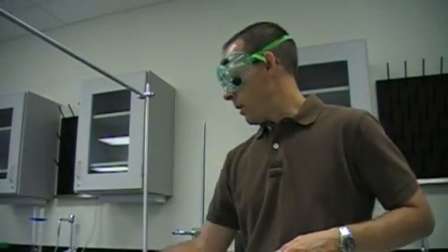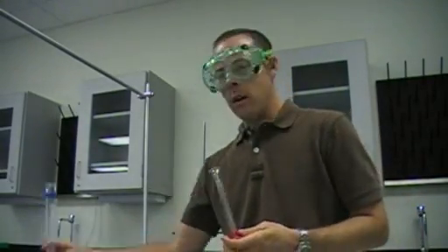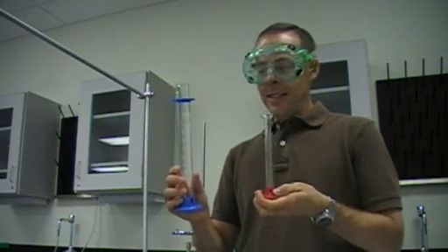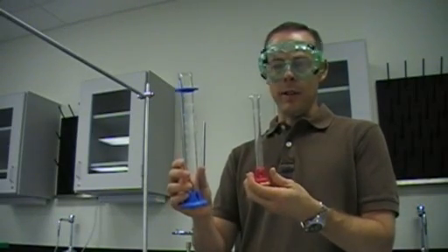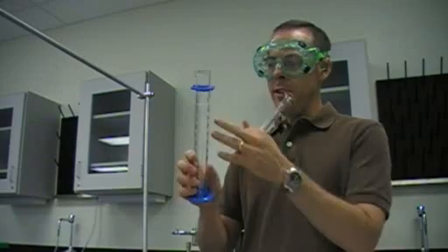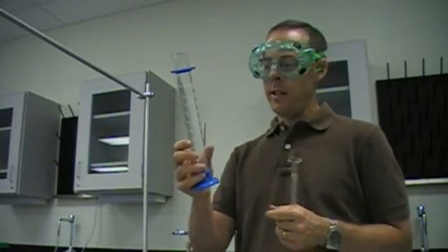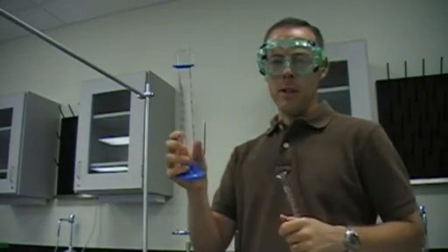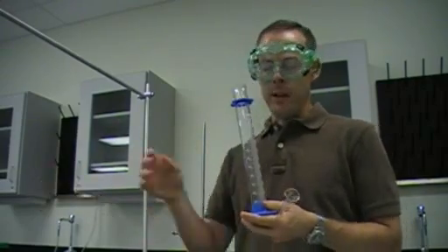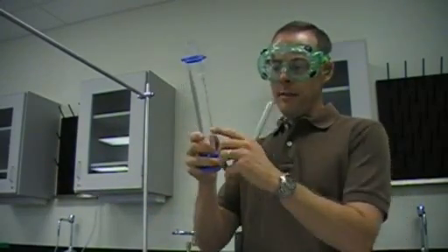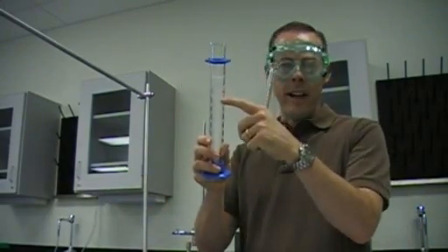The other two things you should be familiar with from other classes are graduated cylinders. And these are ways that we would measure stuff not approximately, but specifically. As we look at this one, this is a 100 milliliter graduated cylinder, each of these lines represents 1 milliliter. These are much more expensive than a beaker because they have more or less determined that these are fairly accurate to 1 milliliter apiece.